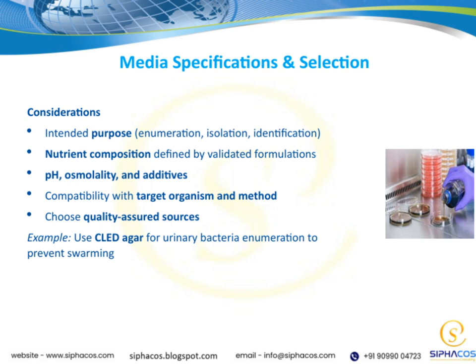For example, if you're working with urinary bacteria, CLED agar is a great choice because it prevents swarming and allows for accurate enumeration. Finally, always choose quality-assured sources for your media. Using reputable suppliers ensures that your media meet the necessary standards, which is essential for obtaining accurate and reproducible results. All these considerations help us select the most appropriate media, ultimately supporting the overall quality and reliability of our microbiological work.